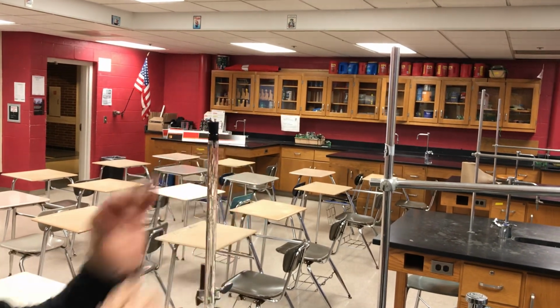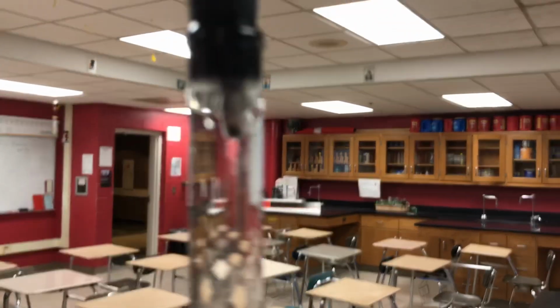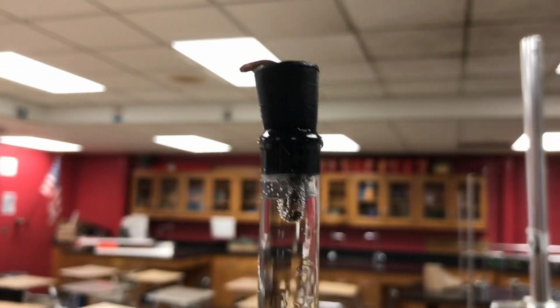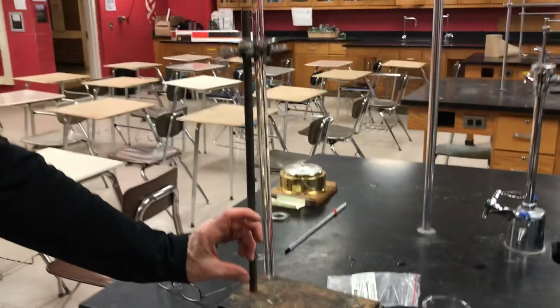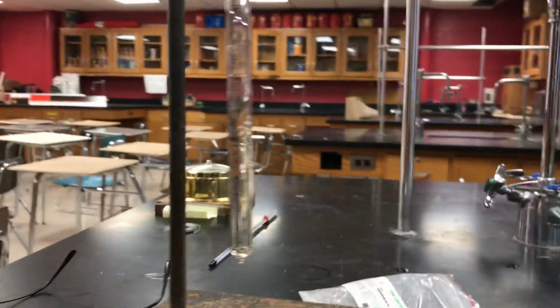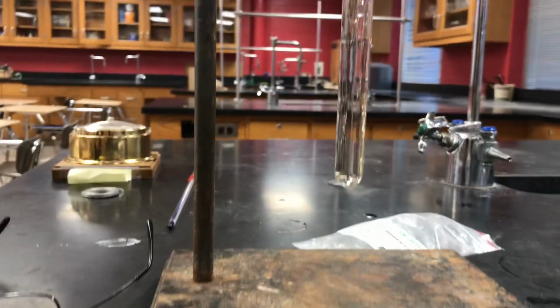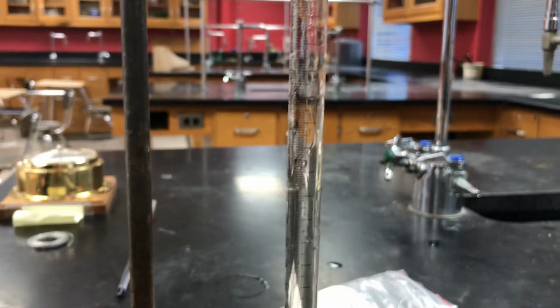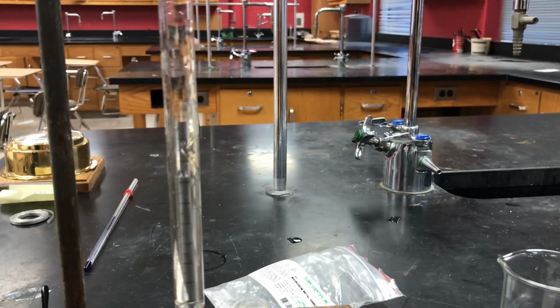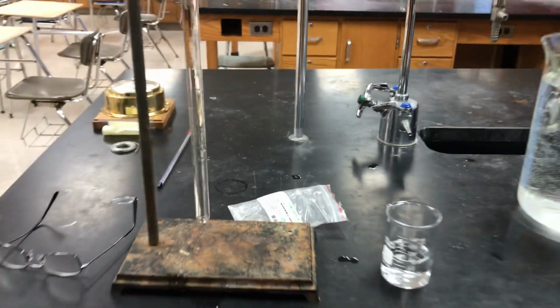Okay, so there we go. Magnesium's in place. A bit bubbly, but you can see the piece of magnesium is right up there next to the stopper. And then our concentrated HCl, for the most part, still sitting on the bottom. Right about there. I don't know if you could see that on the camera, but that's where our HCl meets the tap water.